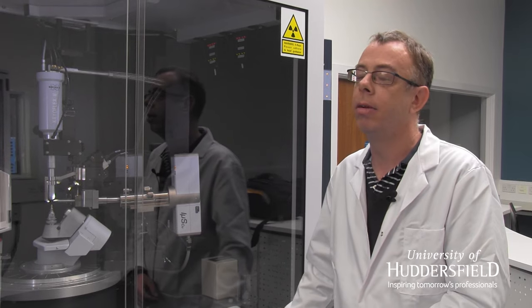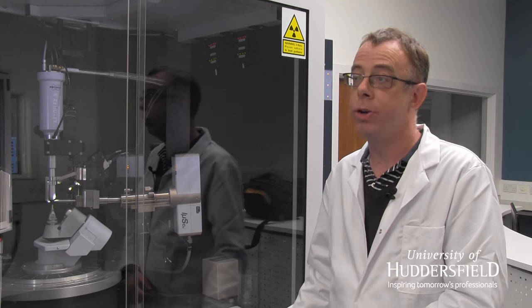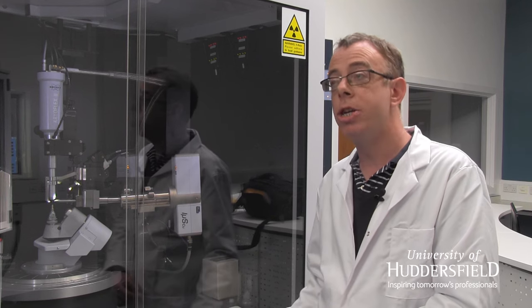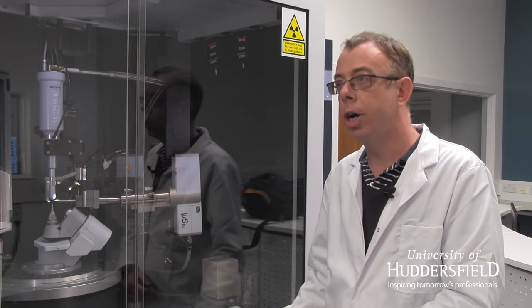This is a Brooker D8 Venture diffractometer. This is a real cutting edge piece of instrumentation. We were one of the first universities to buy one of these in the country. There are only a handful and it really is at the cutting edge of science.